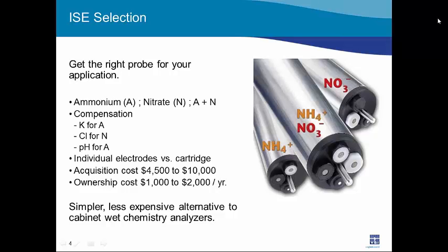It is also important that for ammonium systems that operate on the basic side of neutral, some pH compensation is done. And this doesn't necessarily need to be integrated into the ammonium nitrate probe. It can be done with a separate probe also in the sample.